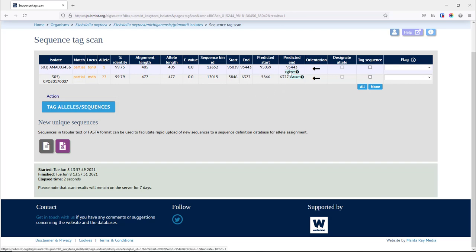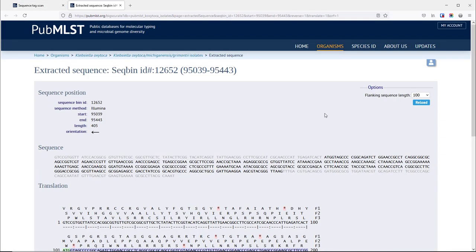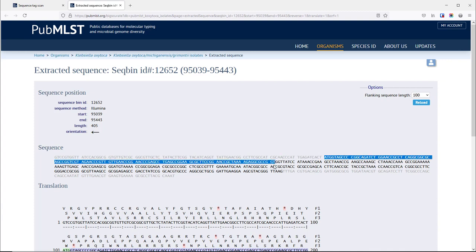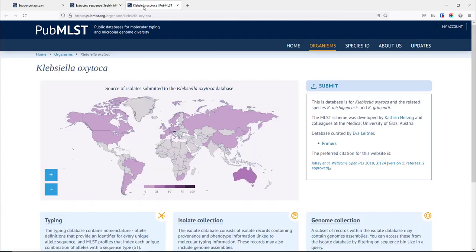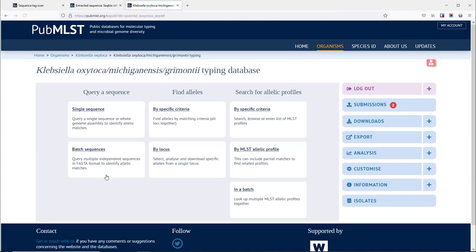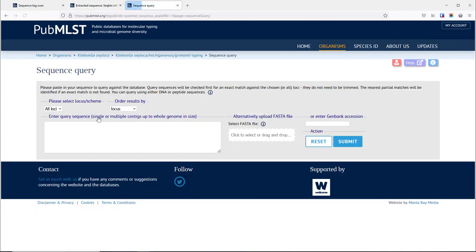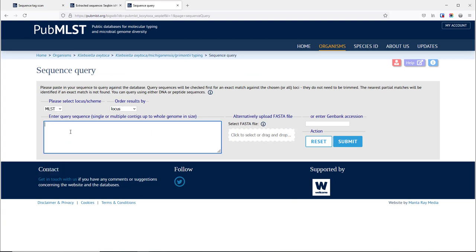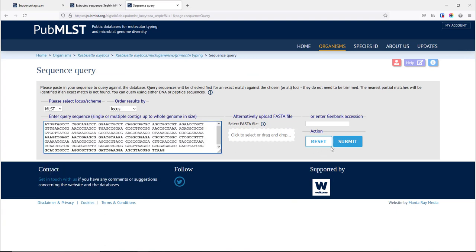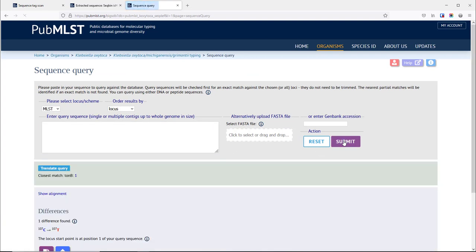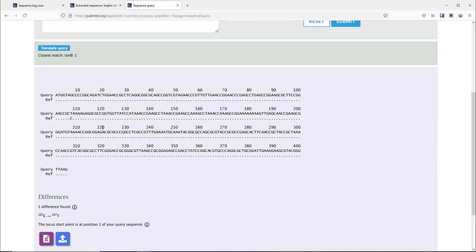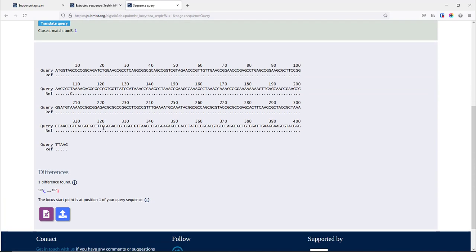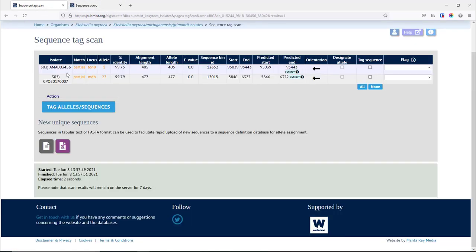If you click the extract link in the table then it will show you the sequence that the scan has found along with some upstream and downstream flanking sequence. We can copy and paste this sequence and use the typing database sequence query page to check that this has been properly extracted, that it looks like existing alleles. You'll see in this case it's a very close match, it aligns properly with the start and stop position of existing alleles.